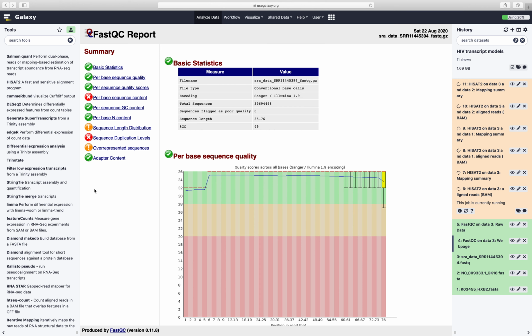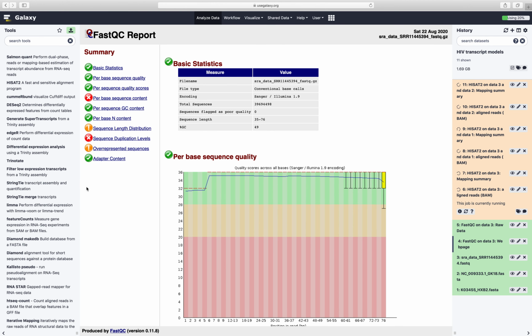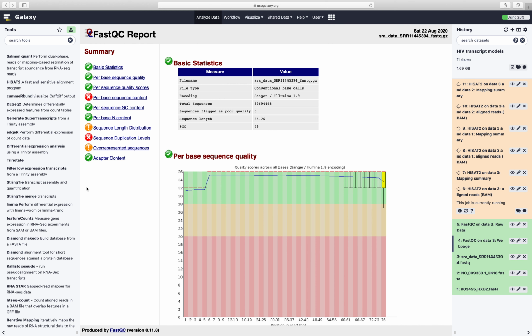And these bioinformatics tools have weird names. They're usually weird to help you remember that they exist. And sometimes the names help you figure out what the tools do. Sometimes they're just arbitrary.